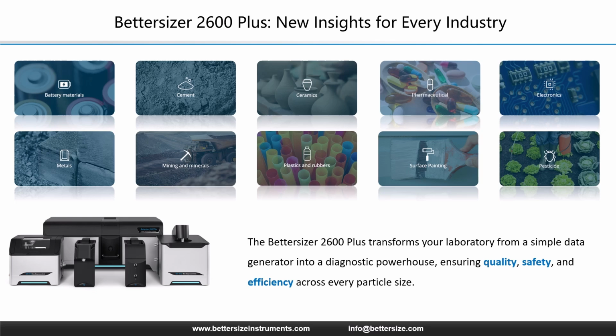We end here not with a list of features, but with the new insights the Bettersizer 2600 Plus brings to your industry. We are moving beyond simple particle size to process intelligence. In batteries, we move from measuring average size to ensuring safety. By detecting a single large agglomerate that causes a short circuit, we protect the battery's integrity.